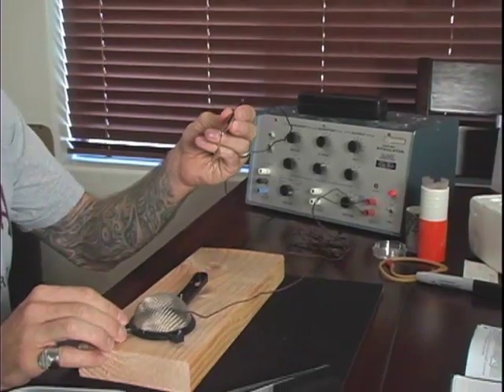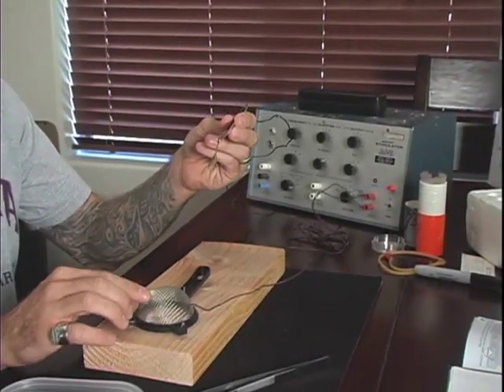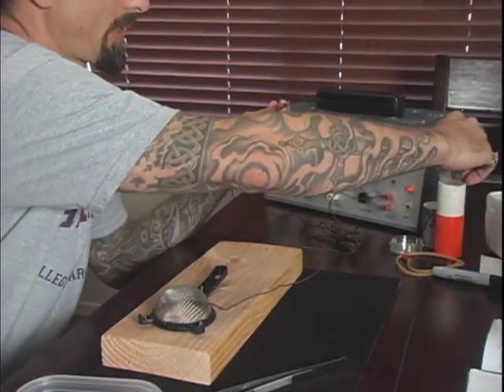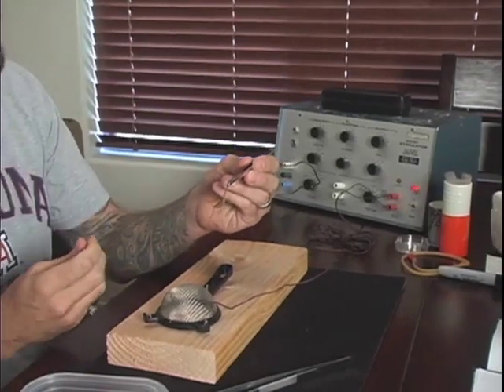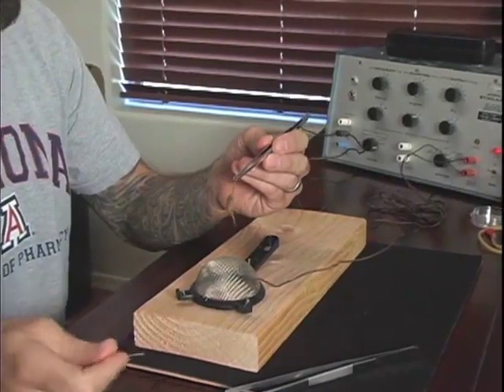To administer the stimulation, I hold the scorpion with a pair of forceps. The forceps have a positive electrical lead attached to them. Another wire — a negative electrical lead — is attached to this T-strainer. When I touch the scorpion to the T-strainer, it completes the circuit and the scorpion receives a low electrical stimulation.